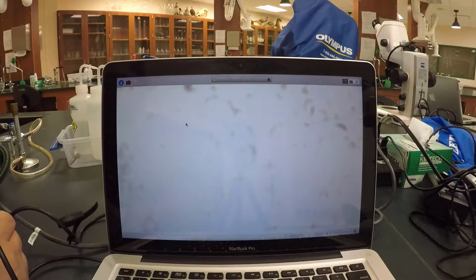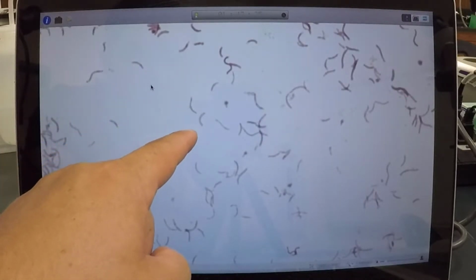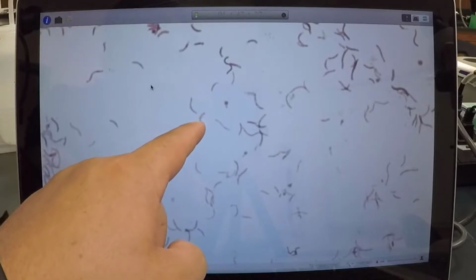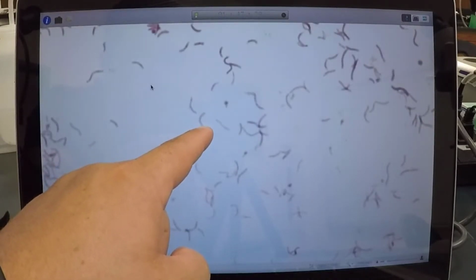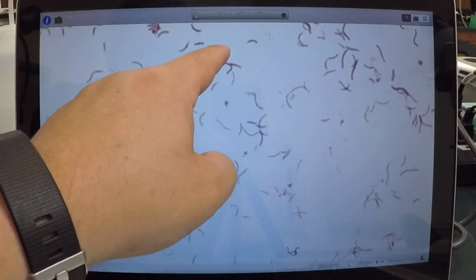Okay, so here's another bacteria type. Again, under 1,000 times your eyesight. And you can see that these are not rod-shaped. They can be linked together, but these are more of a corkscrew shape. So some of them make more of a corkscrew. A lot of these, you can see this one's kind of corkscrew, that one's a corkscrew.